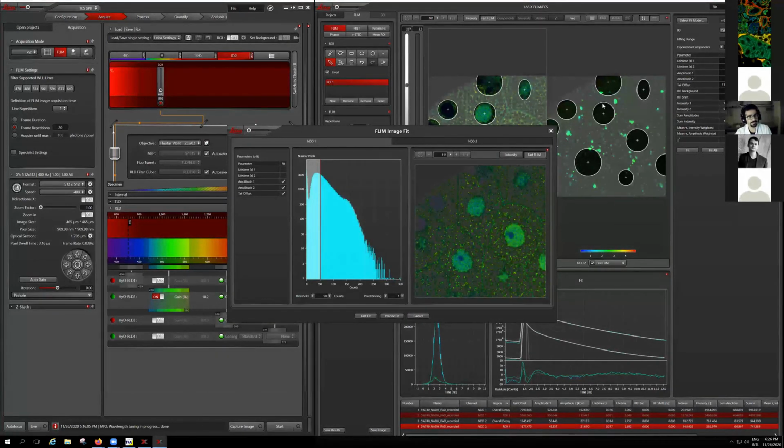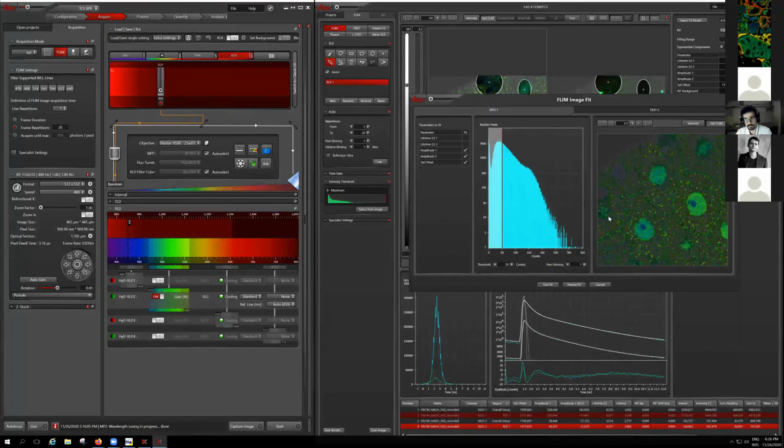Here, the whole idea is that when you do the overall fitting, you find the lifetimes and keep them fixed, you don't change them over the pixels, and then you try to find the amplitude. What is important here is that when you are solving a problem using iterative algorithms for fitting, you need to make sure that you fix as many of the parameters as possible.